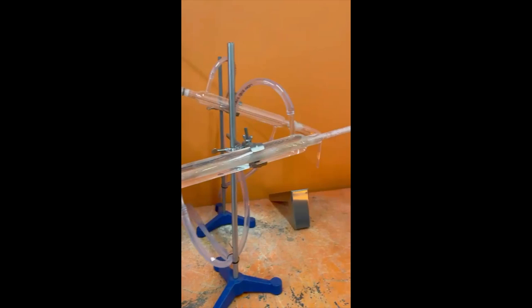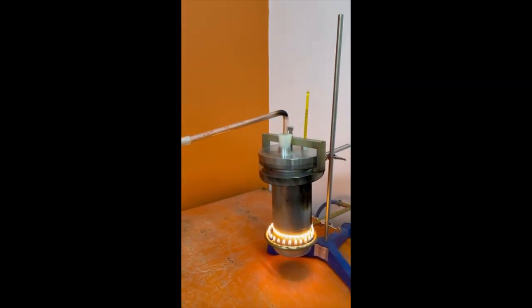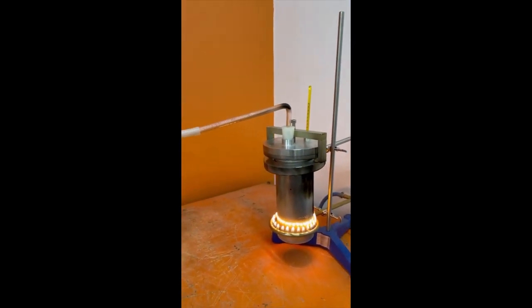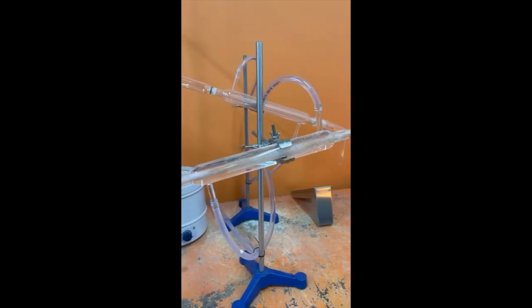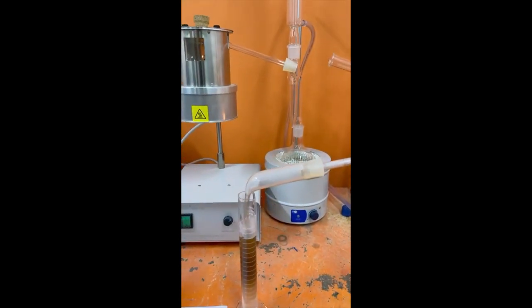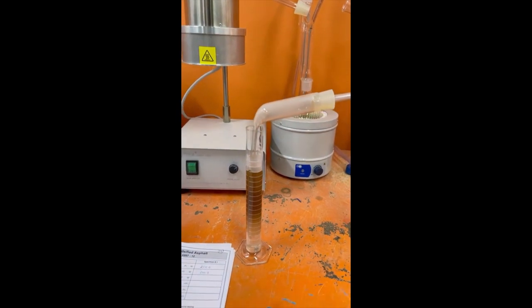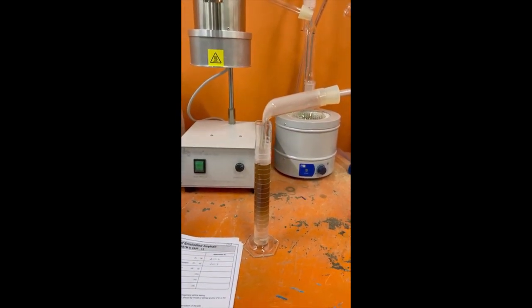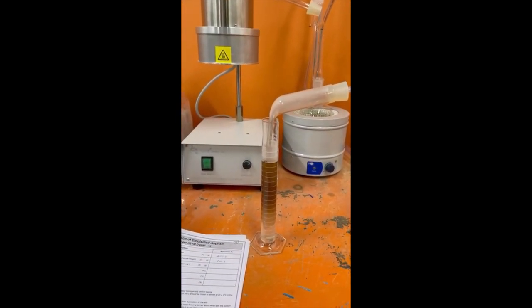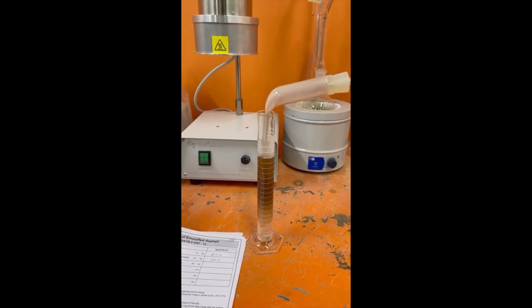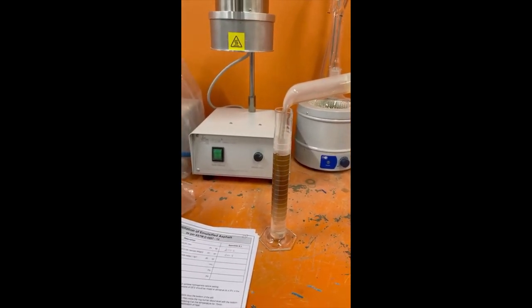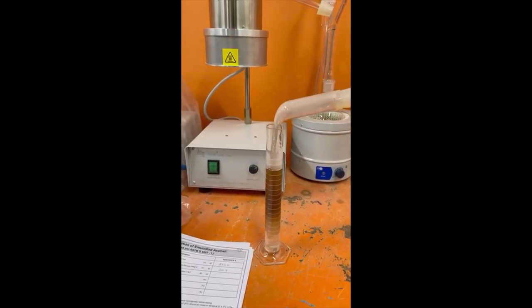This is a test of distillation of emulsified asphalt as per ASTM D6997. Now as we can see, we can calculate the percent of the distilled oil and water coming from emulsified asphalt at 260 degrees.